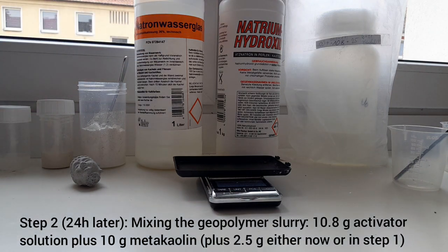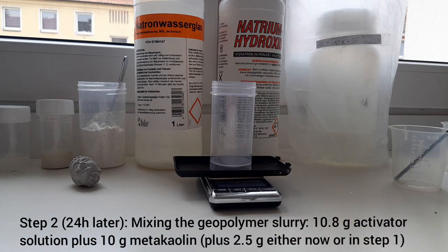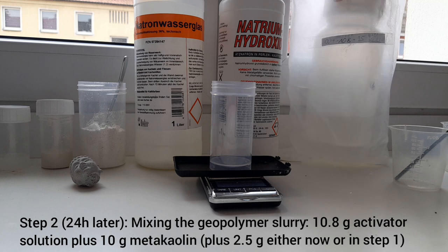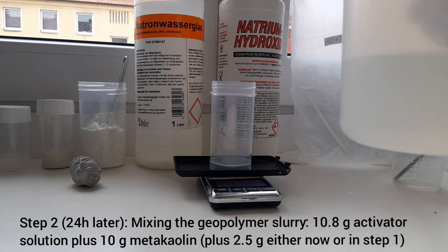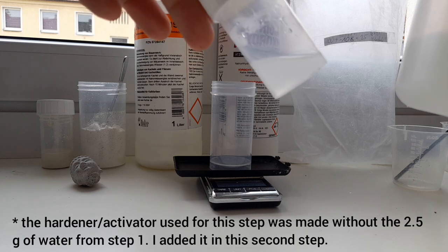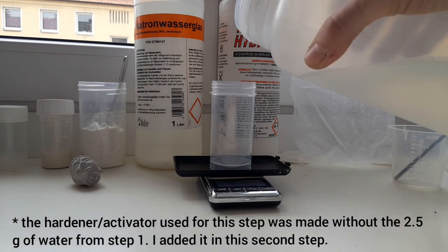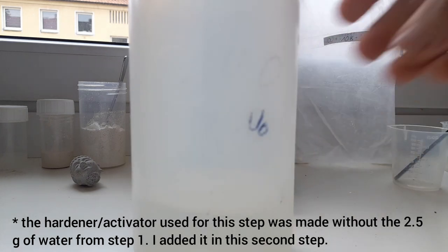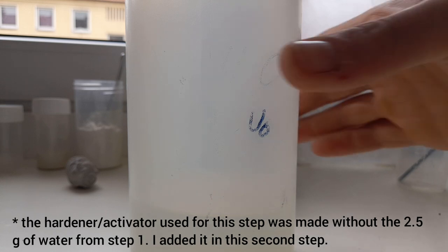Now imagine it's 24 hours later. Switch on the scale and take the activator or hardener solution, which as you can see is completely clear — not cloudy as before. In chemistry we want solutions to be as clear as possible. I need 10.8 grams of this solution.